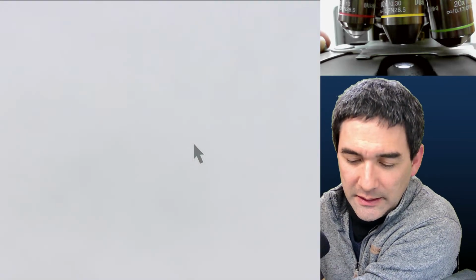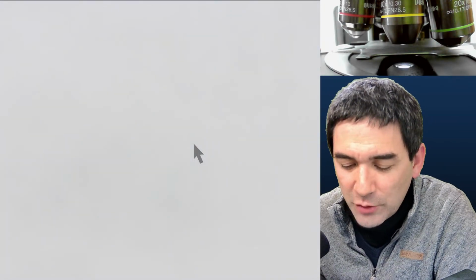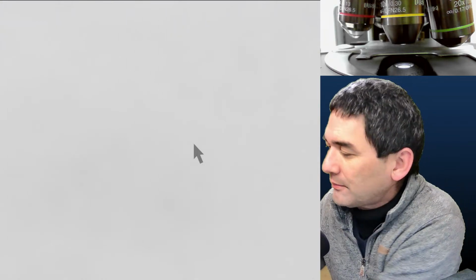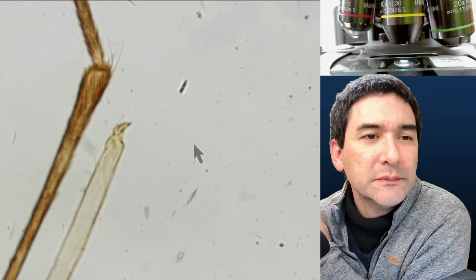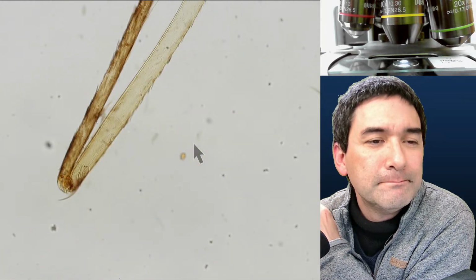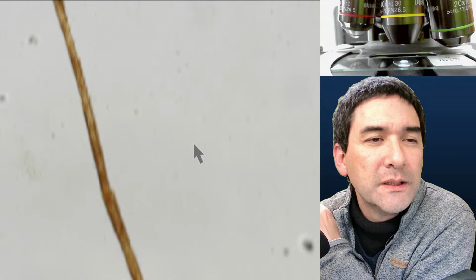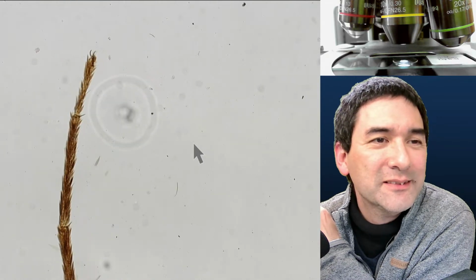So, and here are the legs. First we had the wings, and now we are with the leg section, mosquito leg. Yep, leg of a mosquito. Let's have a look. Wow, that is a long one. I mean, we know that mosquitoes have long legs.